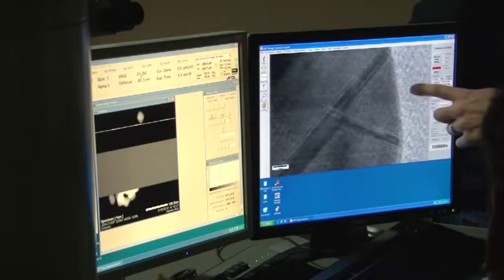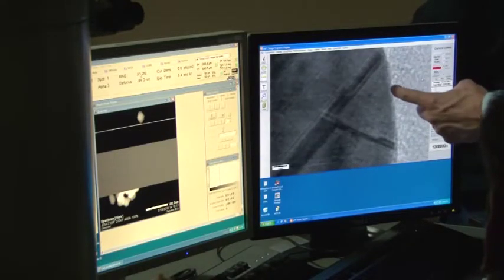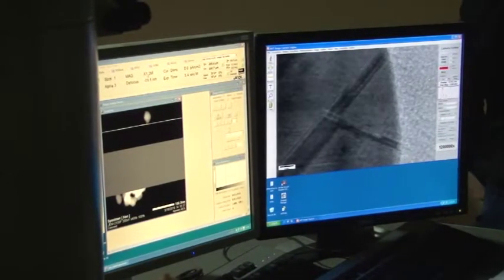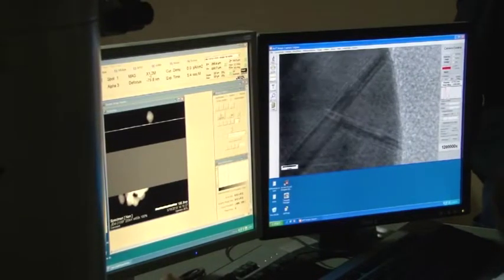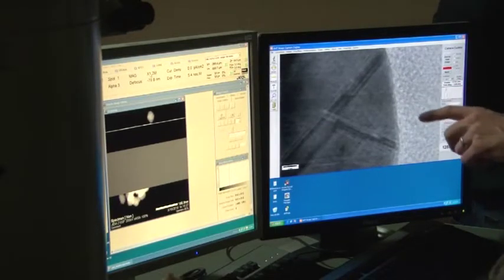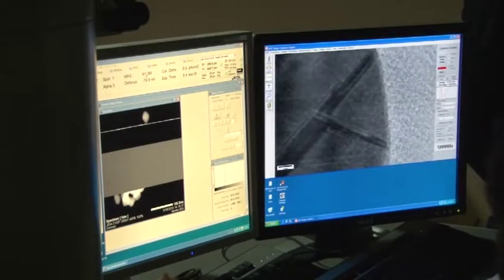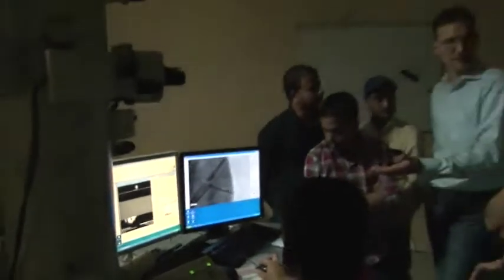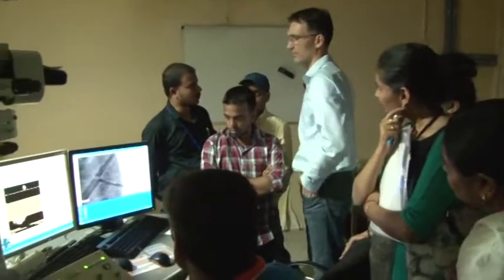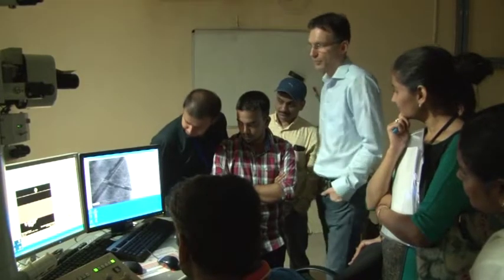You see this delocalization, the fringes here in the vacuum. I mean, the particle appears to end here. Because this is gold, there's even some inelastic scattering, phonon excitation things, absorption contrast, so that overlaps with the phase contrast. And this is this delocalization I was talking about. In principle, the intensity shouldn't be there to interpret the data, so there are no atoms. But there is intensity in the image, like periodic intensity. That can only be explained by the aberration, and it depends on the defocus here. Change the defocus.